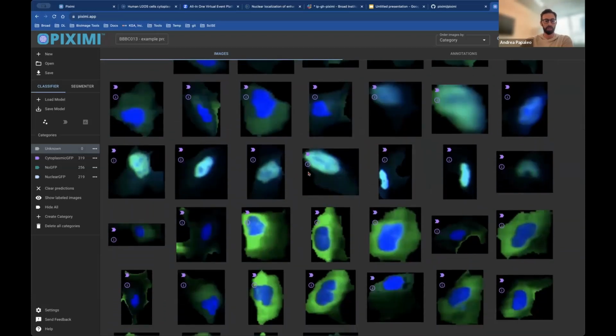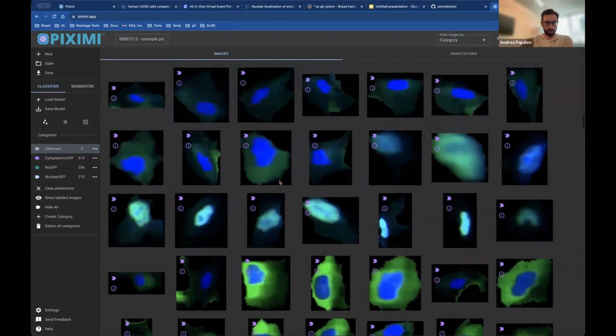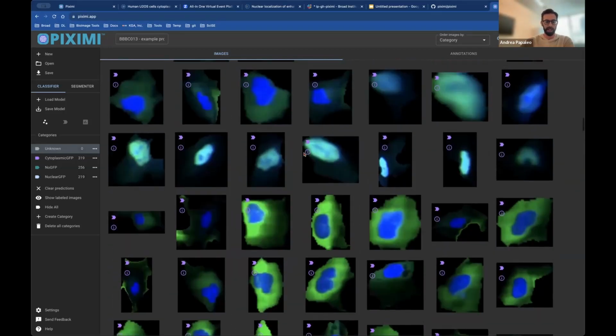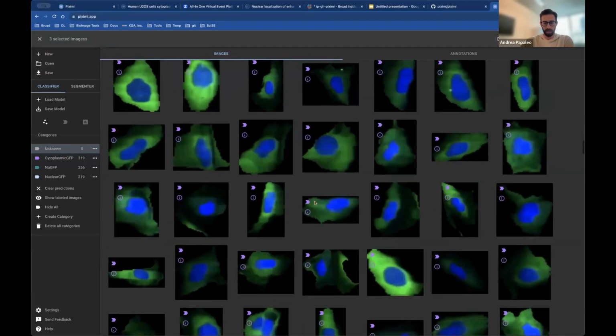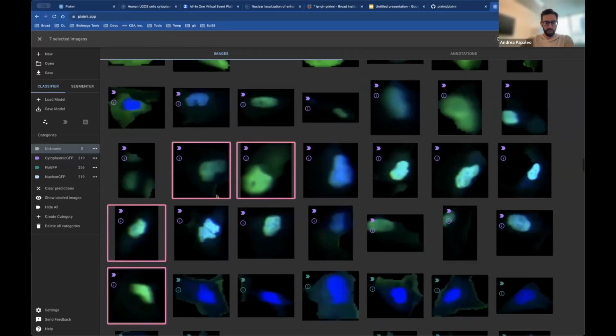And then we say, oh, this doesn't necessarily seem right. Full disclosure here, I am not a trained biologist, so I haven't spent a lot of time looking at the images, and I can't really tell from first look exactly what should or shouldn't be no GFP or nuclear GFP. But these do look a little greenish in the nucleus. If we go through and look for some more, this definitely is. And so, yeah, we know these are wrong.